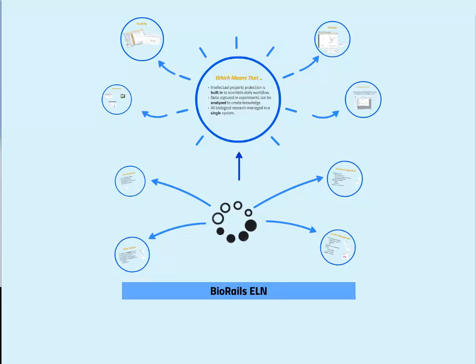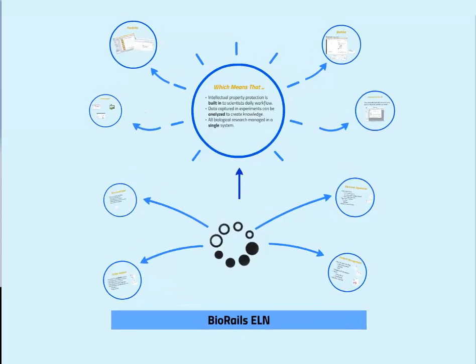So that gives you an overview of all of the different elements of the Biology ELN. So it allows you to build up content within a folder. It allows you to manage that content in terms of version control, add additional files, images, annotate them, and review the data. It also allows you then to capture structured data within the same experiment to enable searching, and also then to sign off on that content.